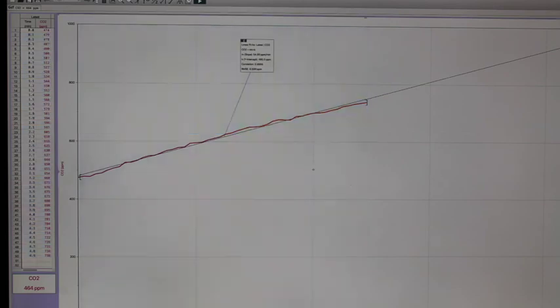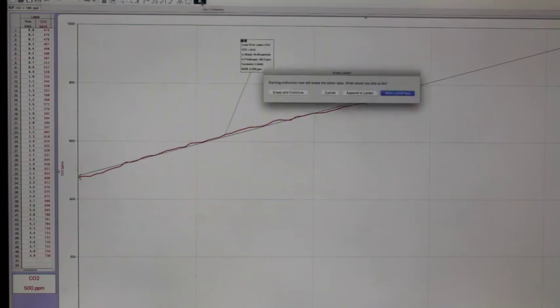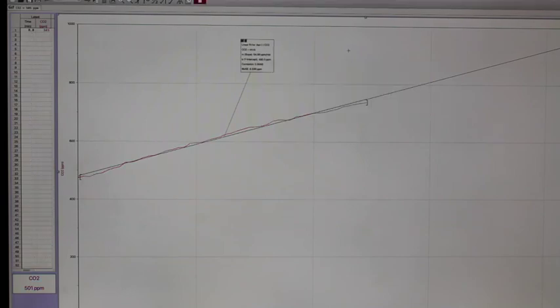So I'll go here, I'll click that off. The crickets have been under here for 5 minutes, and so now they're nice and cool. So I'm going to go up here, click play, start. Now I'm going to store the latest run so we can see both of these together, and they'll both be on the same scale. And there we go. So we started just about at the same level of CO2, which is good. You can see that so far the line has a lower slope than the other line. If it continues that way, we'll see. We're going to run this over the course of 5 minutes.